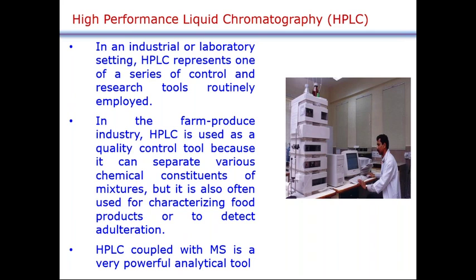And the reason it is used is that you can separate a variety of chemical constituents and analytes from mixtures using this technique. You can do quantification, you can find adulterants, you can find contaminants.